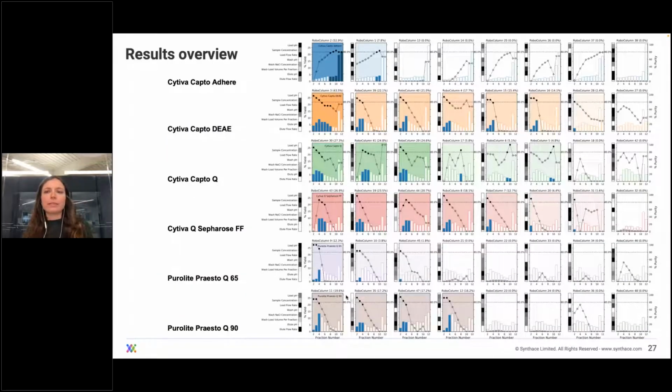So let's take a brief look at the overall results of this space-filling DOE. Here, each of the rows is a different resin type. The bars in the plot represent the yield of the individual collected fractions in this robocolumn purification run. The horizontal line indicates 80% purity. Shade depth of each color represents yield of the best pool, pulling together adjacent fractions which fulfill this 80% purity cutoff. And the runs are organized from best to worst.